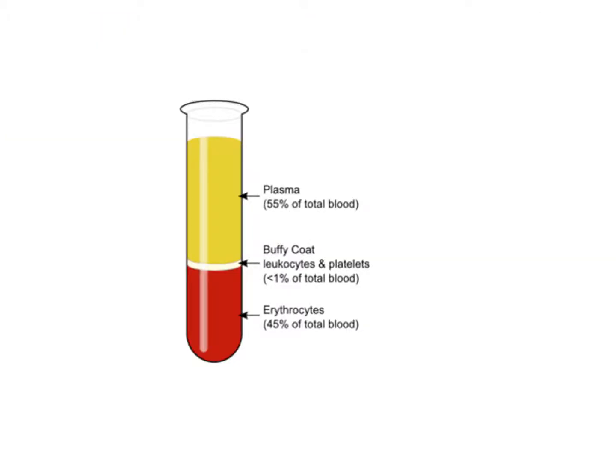So here's our blood that if we separate out, so some of the earliest centrifugation for the clinical side was just separating your red blood cells, your leukocytes, and your plasma. And so for blood donors and things, you could look.